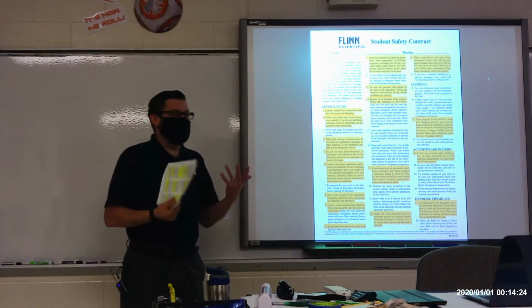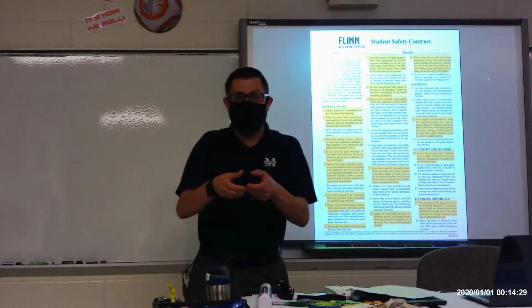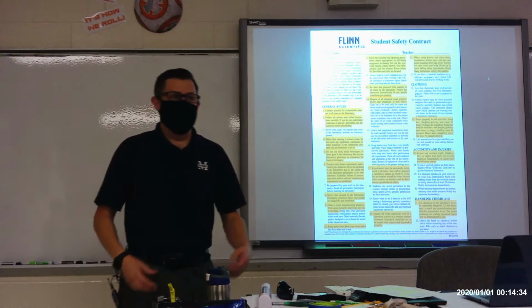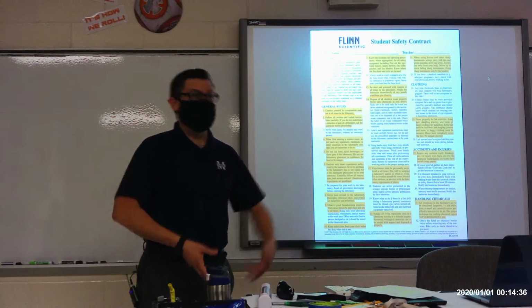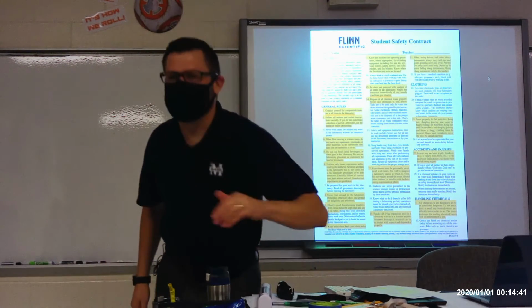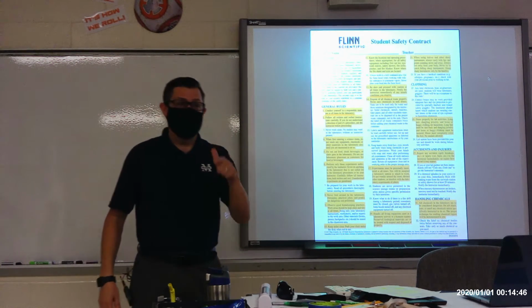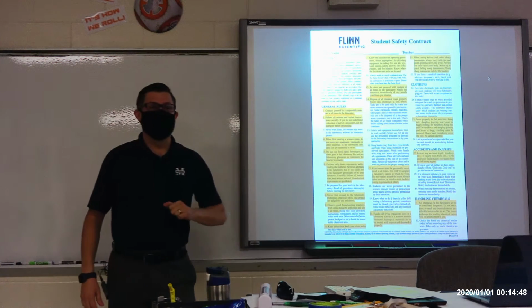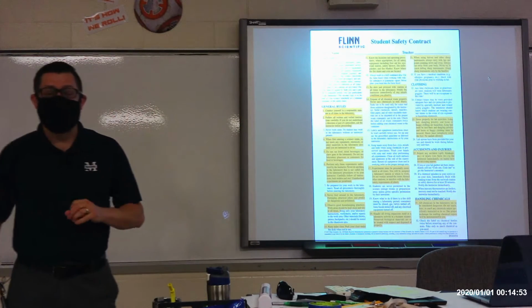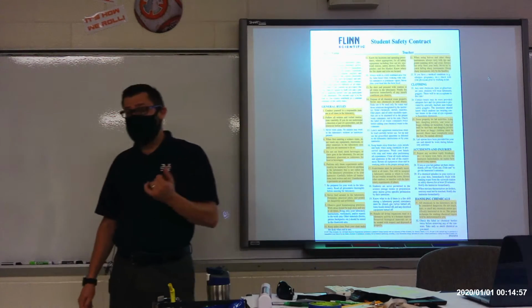And you may not think it's something that can hurt somebody. Like, hey, I have this dead frog and it's kind of funny and I'm going to stick it in this person's face and that's going to startle them. Well, if someone gets startled and they reel back, they could fall back and hit one of these lab tables and crack their skull open. That funny joke, all of a sudden not funny anymore. And if you don't think it could happen, let me tell you, I've had it happen before, in possibly the most ridiculous manner ever.